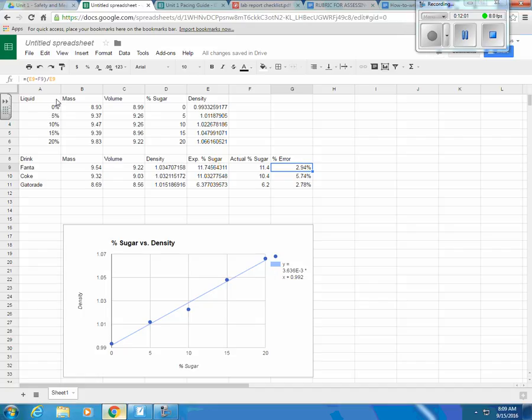So these are the two tables you need to put into your lab report. You need to have all three of these things: this table right here, this table right here, and this chart. All three of these are critical components to your lab report. Follow this exactly as I've done it, and you will not have any problems creating your graph or calculating your numbers. Now, you do have to use your own numbers. These are the numbers that I got when I did the lab. You need to use your own numbers when you're calculating your results.